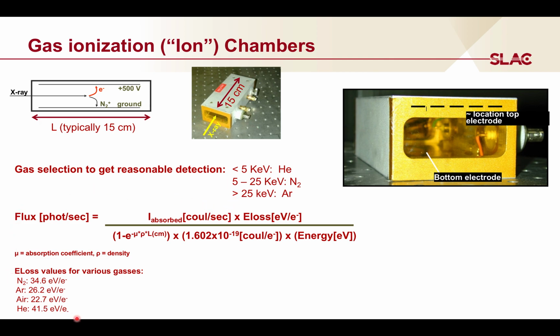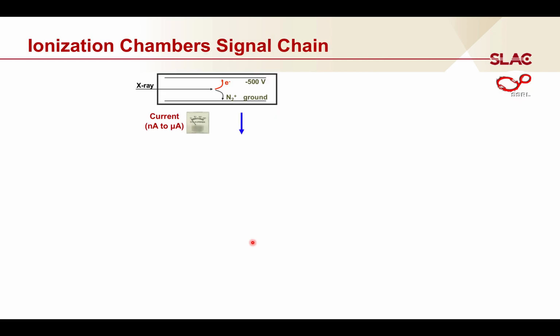You can calculate flux using this equation. I have some of the parametric values needed to do this. This is something we do as a typical diagnostic at the beamline. It's actually a pretty cool thing to do every now and then and just see how different things affect the flux. I'm just leaving this information here so you can do it later by yourself.